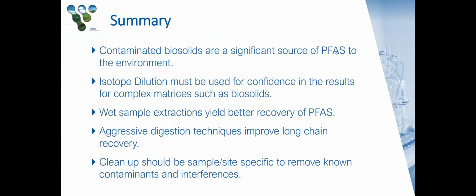So in closing, and to summarize, contaminated biosolids are a significant source of PFAS to the environment. The way we deal with the solid fraction of biosolids means that it can easily re-enter into the environment via landfill leachates or spreading onto fields. Because of all the different interactions within a biosolid matrix, isotope dilution must be used to get accurate results.